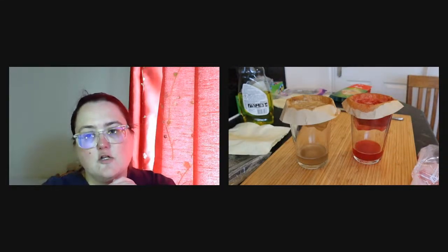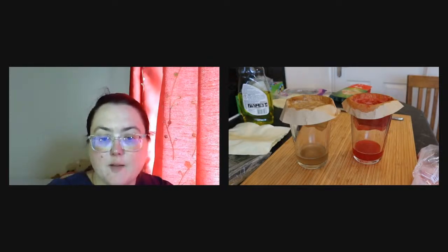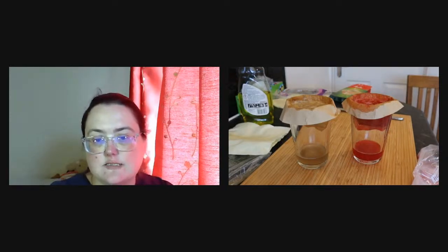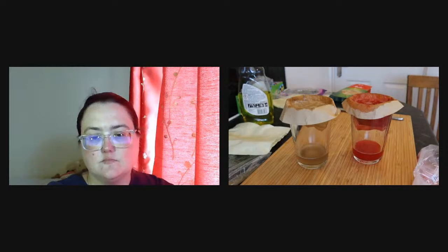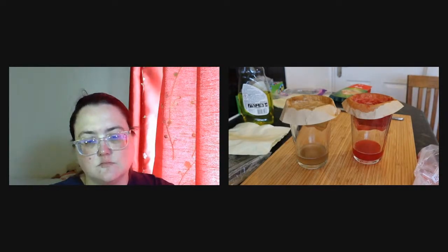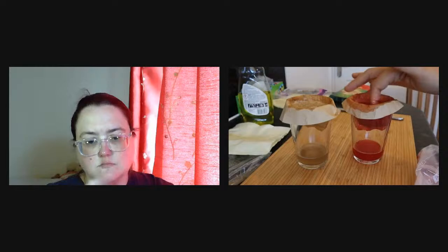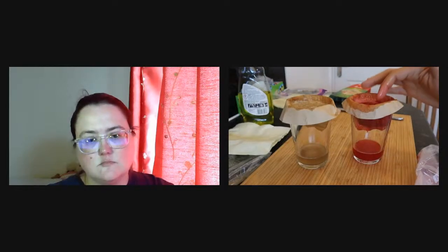So Remy, I saw you put your finger in the filter. What would have happened if we had broken the coffee filter? If you try to make things go faster by mixing a little bit, this is what I was doing, trying to mix so that it can go a little bit faster. If you're not careful enough, you may break the filter.